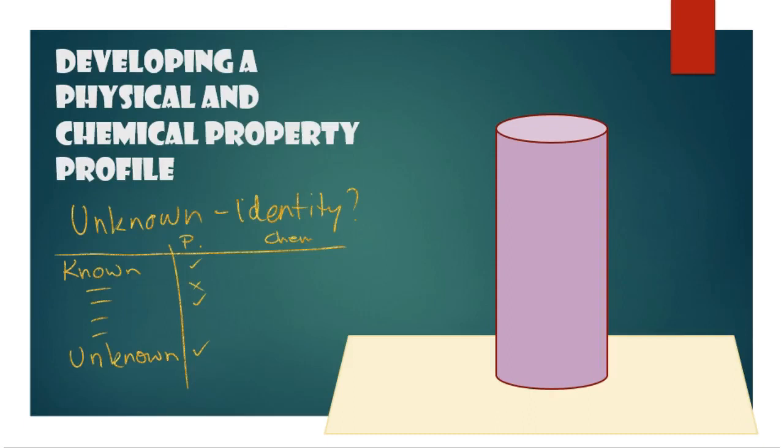First of all, you just have to look at it without doing anything to it. You must just look at it. Okay? So we get a small amount of that white substance. I think I've said in there only about a quarter of a spatula, and put it in your test tube and have a look at it and record down the different physical and chemical characteristics that I've asked you to. That's number one. Number two, we're going to look and see what happens when we mix it with certain substances. It may dissolve, it may not dissolve, it may chemically react. You have to find out.